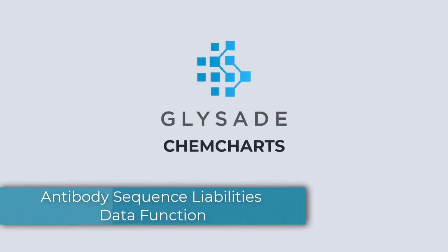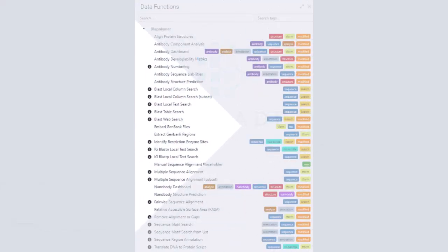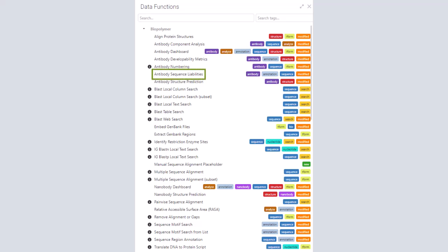In this video, we'll look at the Antibody Sequence Liabilities data function in ChemCharts. The Antibody Sequence Liabilities data function identifies sequences that could be potentially problematic during antibody development.